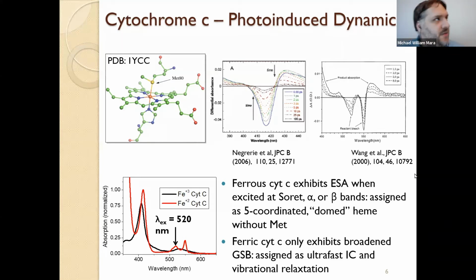In this case, basically we looked at the intensity of the K alpha emission as a function of the laser fluence. And then you cut off right before the end of the sort of linear regime there. And this gives us around a 70% excitation fraction. So you have around 30% of your sample that remains in the ground state.